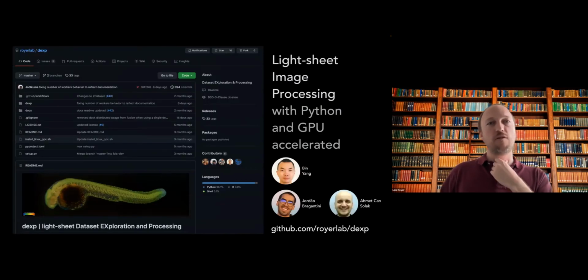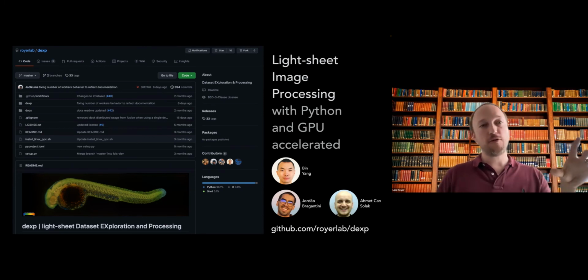So what we've done is, first, of course, we have our own code for image processing of light-sheet data that encompasses everything from registration, motion stabilization, fusion, deconvolution, dehazing, intensity equalization, and more things. Diffeomorphic registration in cases where the things tend to wiggle too much. So we have all that, but of course, if you do all of that image processing at scale, we use Dask again, so we can run these things on clusters and process very large data sets.